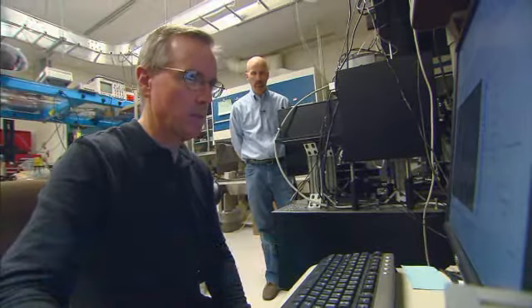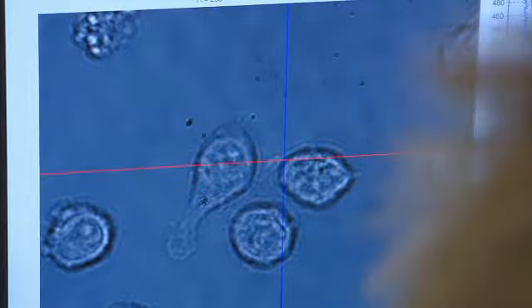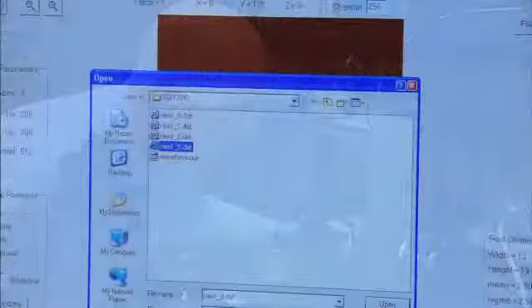So we're just moving the stage and looking at different fields of view and trying to find bright cells. When we do, Helen will focus it.